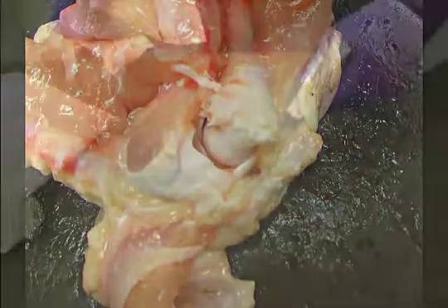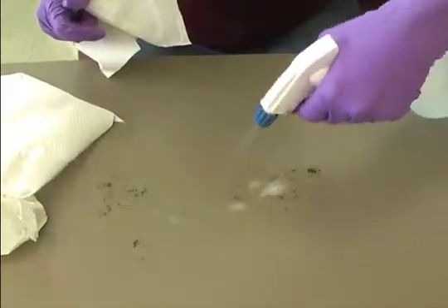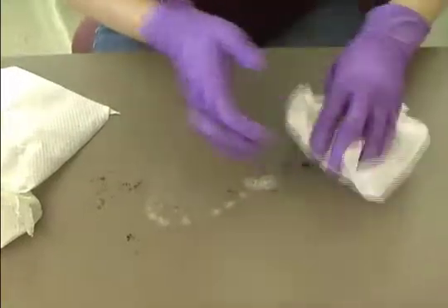Now have the students answer the questions found in the activity. At the end of the investigation, make sure that students clean up their station with disinfectant and thoroughly wash their hands with soap and water.